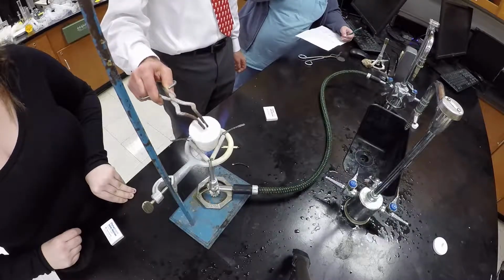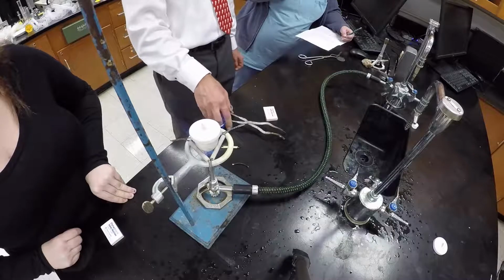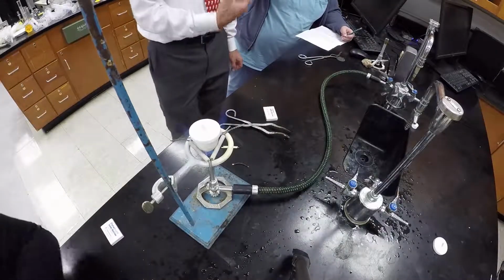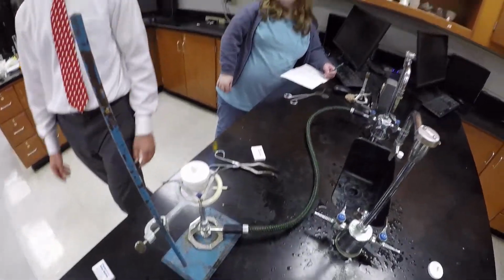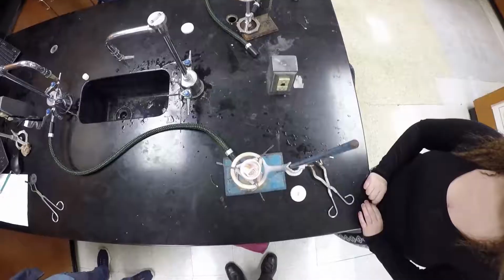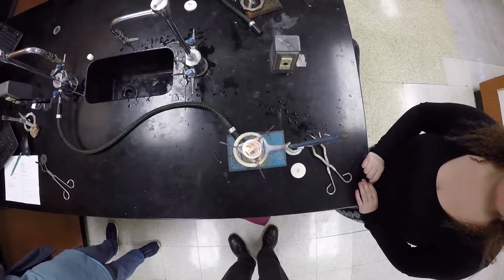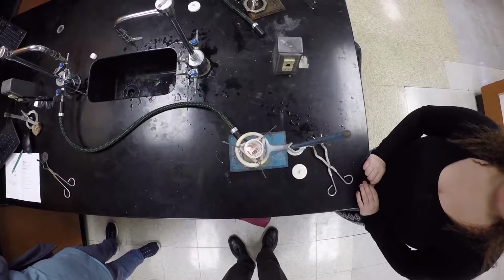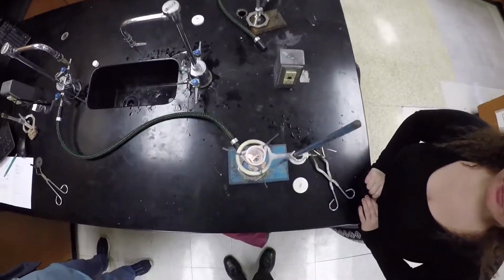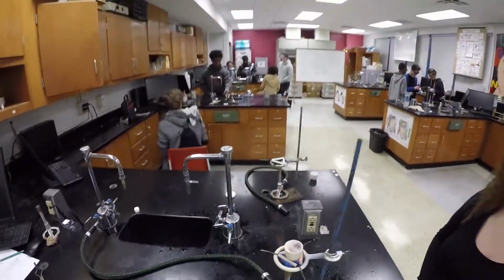So we're going to cover this, let it heat for about, I'd say, 7 minutes. Then we'll uncover it, expose it to a little oxygen. It's not done yet.